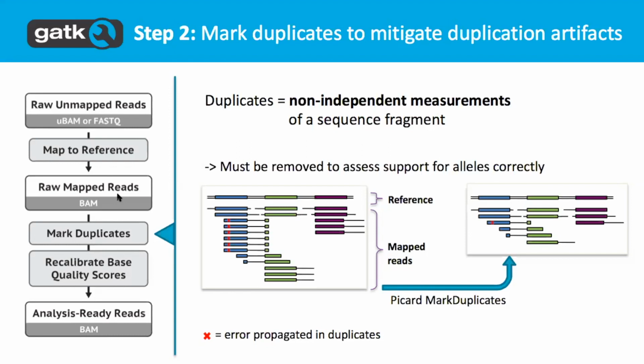So we've done some work. The Broad collaborated with a few other major sequencing centers in North America to define what we call the functional equivalence specification. It's a specification of how you do the alignment and the pre-processing in a way that removes batch effects. If you have a pipeline that's compliant with that specification, you can be pretty sure that any datasets aligned with those compliant pipelines will be compatible. There's a paper about it. If you Google functional equivalence pipeline, it should come up. And there's also a blog post on the GATK blog about it.